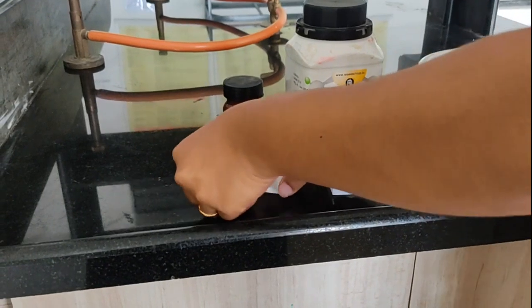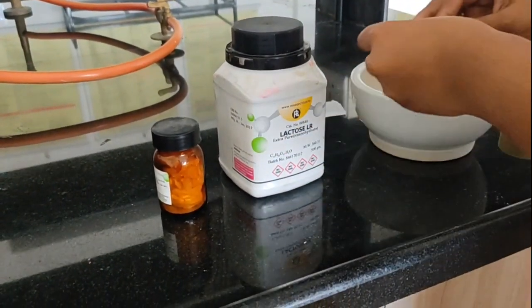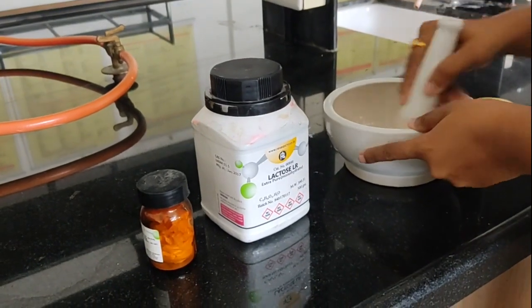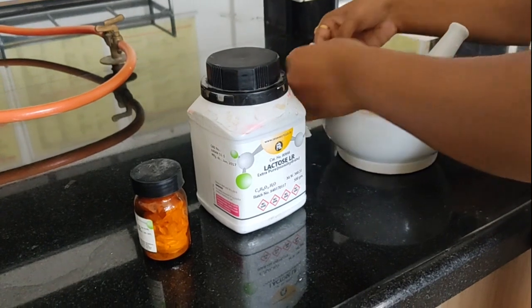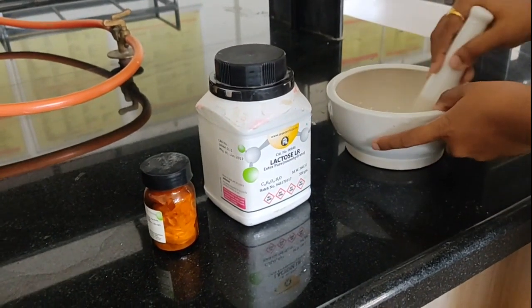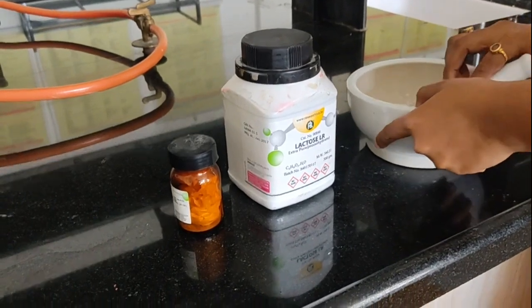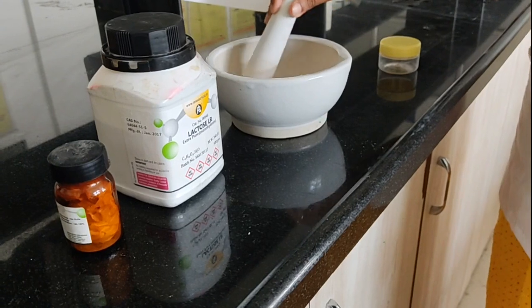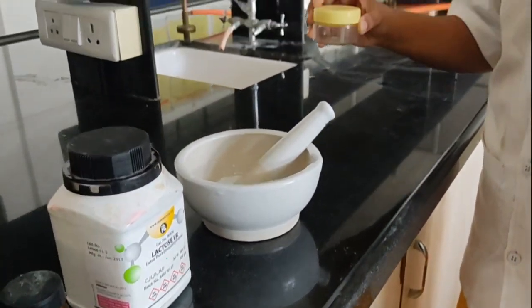First of all, I am going to take this hyoscine hydrobromide into this mortar for trituration. After that, I am going to add lactose into it. First I am going to add only half the amount of lactose and proceed for proper trituration. After proper mixing of both powders, I am going to add the remaining amount of lactose and again proceed for proper mixing. After proper trituration of both the powders, I will transfer this powder onto the white paper for double wrapping and wrap each single packet. After packing, I am going to transfer all 10 packets into this wide mouth bottle, and then we will proceed to the labeling part.